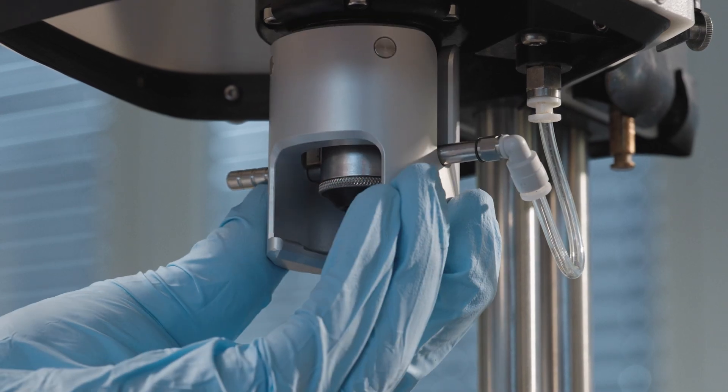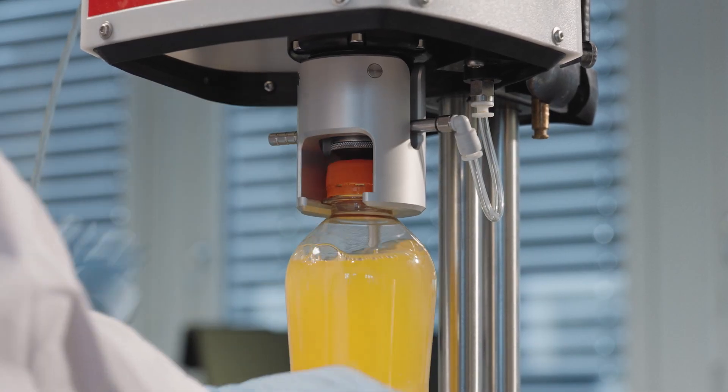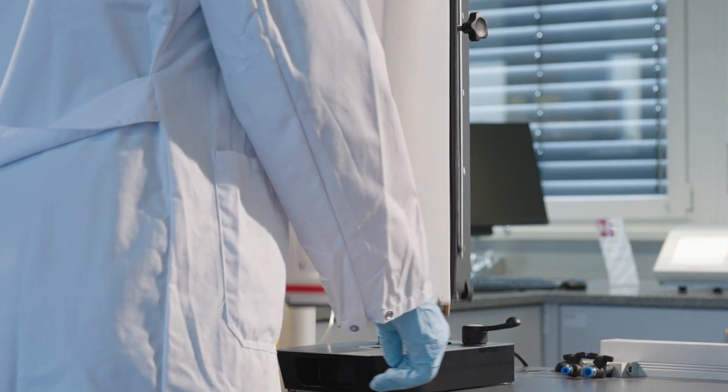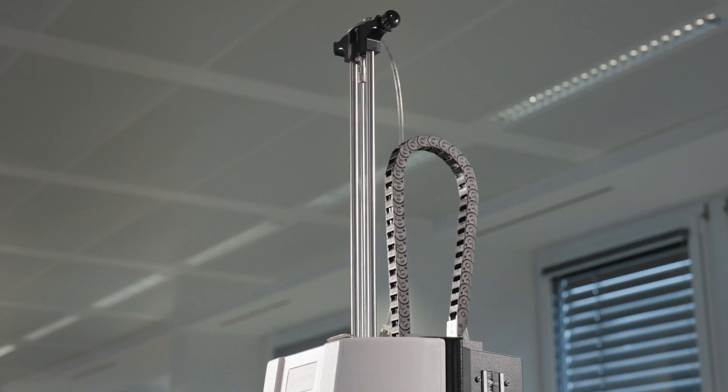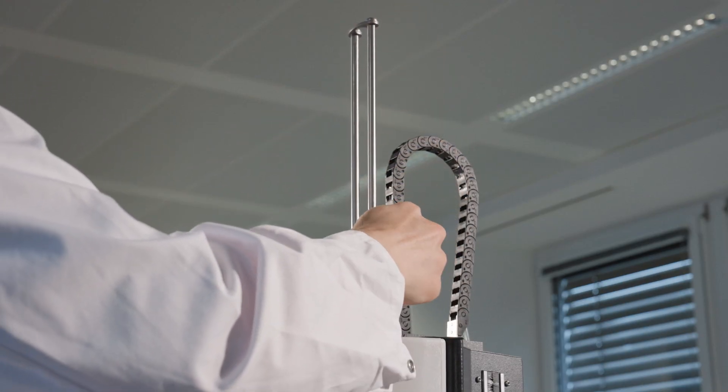For PET bottles, an adapter is needed because they need to hang during measurement. When the sample is positioned correctly, lower the safety shield and activate the pressure. Insert the sample tube to the bottom, then slightly lift it when using the PFD+.